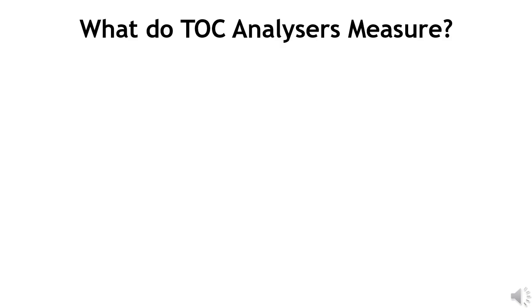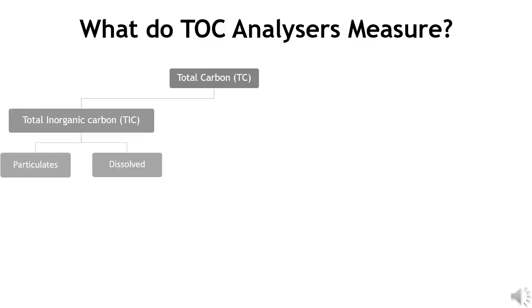What do TOC analyzers measure? TOC analyzers measure total carbon and total inorganic carbon, and the total organic carbon is then measured by difference, where the total inorganic carbon is subtracted from the total carbon.